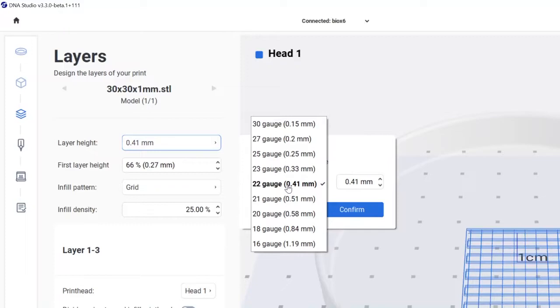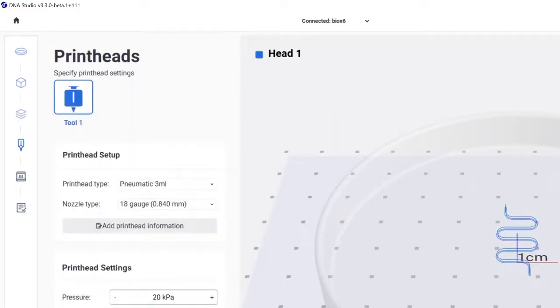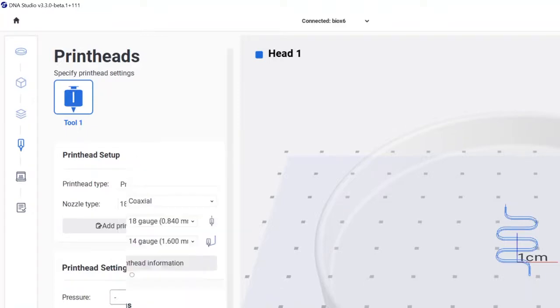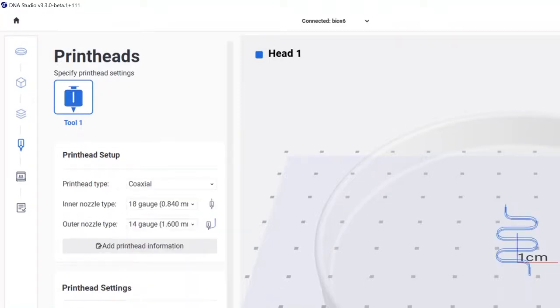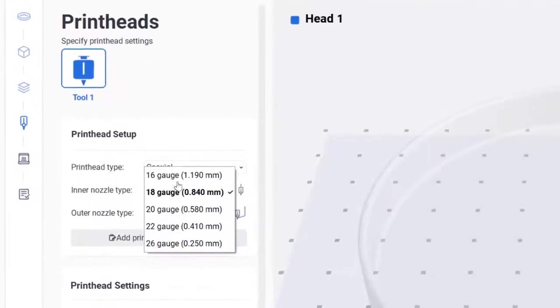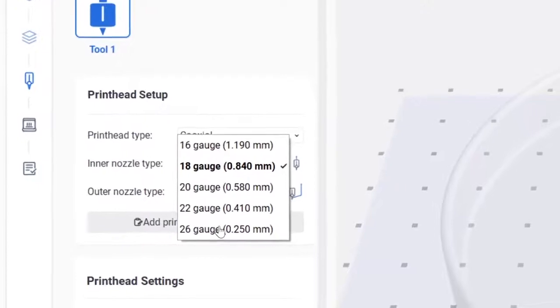Specify the layer height based on your selected nozzle, infill pattern and density, and the printhead type. Select the coaxial from this list. Then select the size for inner nozzle and outer nozzle based on the gauge size that is written on the surface of the nozzle.